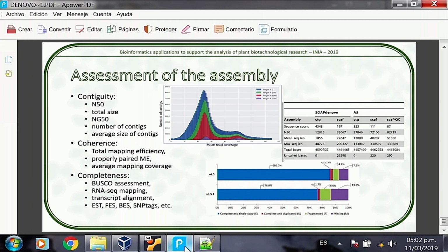Now, what happens if most of the reads that you map to your reference genome are facing outwards when you look at them? Is that a sign of something good happening? If you were expecting all the reads to be looking inwards, why would you find reads looking outwards?